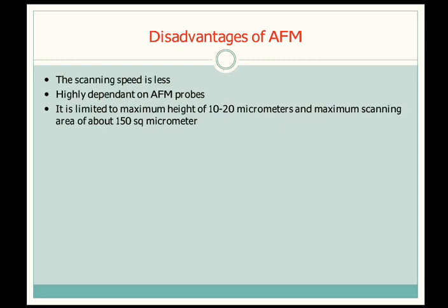Next is disadvantages. The scanning speed is less. The instrument is highly dependent on the probes. So if the probes are working correctly, then it is good. Otherwise, the entire operation cannot be fruitful.